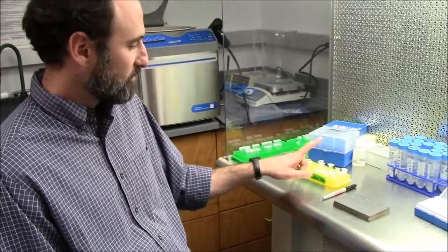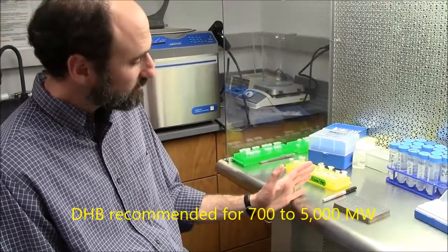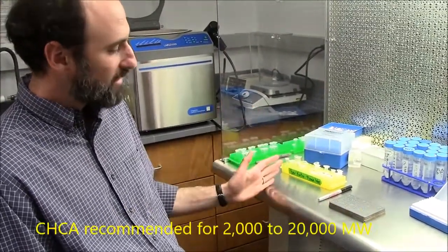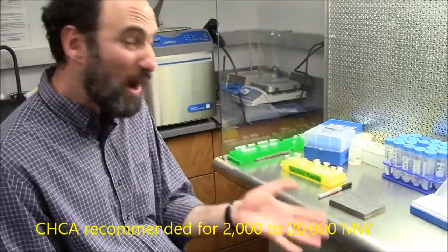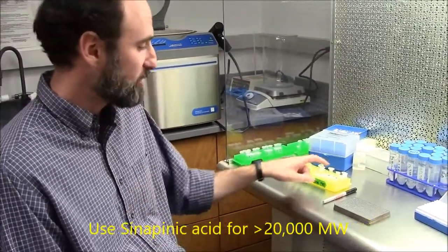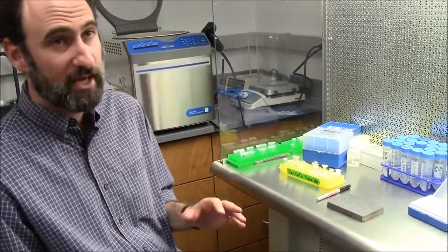and sinapinic acid has clusters up to about 2,000. So I usually recommend people use DHB from about 700 to about 5,000 molecular weight. CHCA takes over from about 2,000 to about 20,000-ish. If you have proteins in the 20,000 range, try both CHCA and sinapinic acid. Sinapinic acid is usually for proteins, intact proteins.